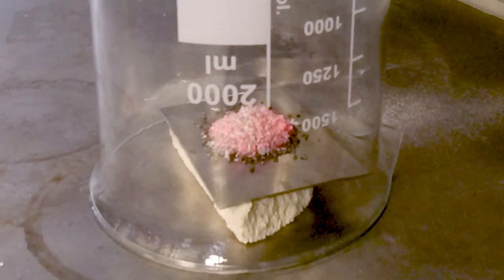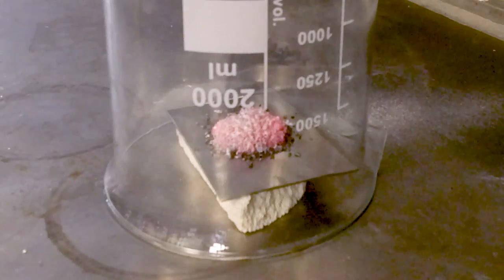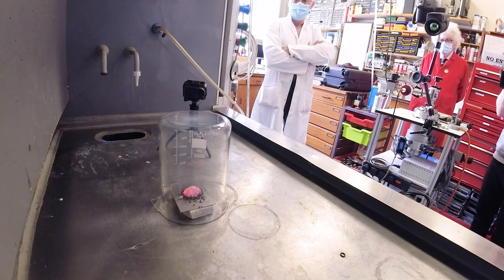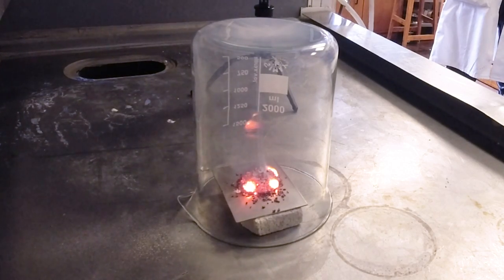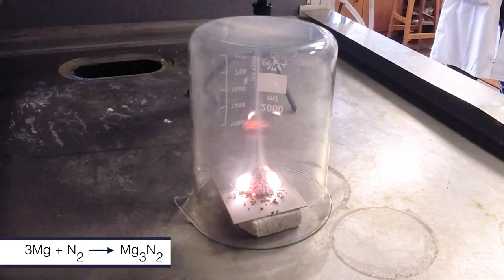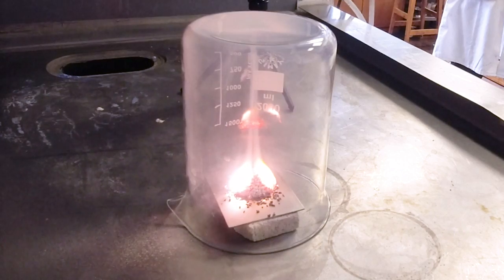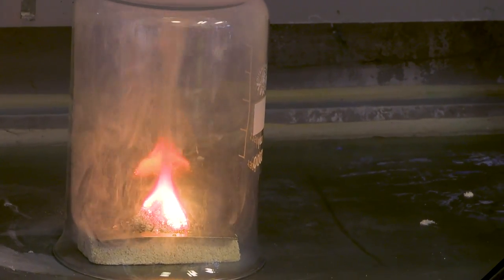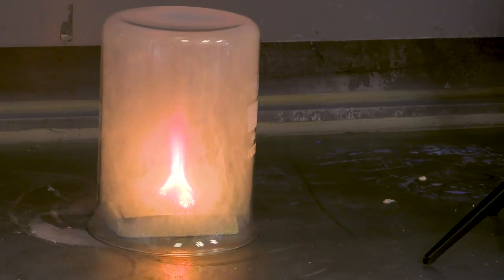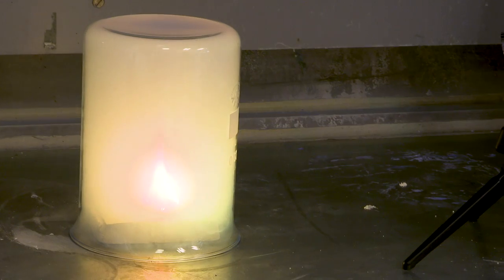As the magnesium is already very hot, it starts burning in nitrogen — reacting with nitrogen. It's quite slow. I thought the reaction wasn't going to happen, and then sparks start coming from this little pyramid, and it starts glowing brighter and brighter. A plume comes out like an erupting volcano, and it reacts until most of the nitrogen is used up. As it starts reacting with the nitrogen, you get a blue-green colour in the flame.